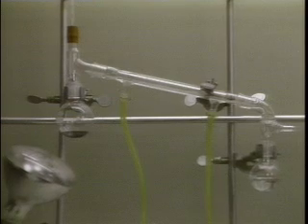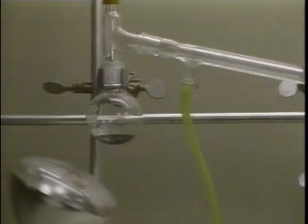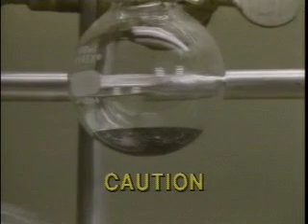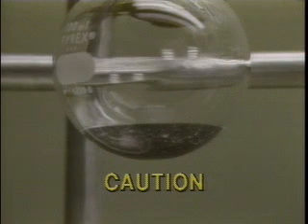However, the distillation must be stopped before the distilling flask is heated to dryness. If the flask is heated to dryness, it may break. Also, the residues remaining in the bottom of the flask often decompose or may be explosive. Thus, it is important to leave a small amount of liquid in the distilling flask.